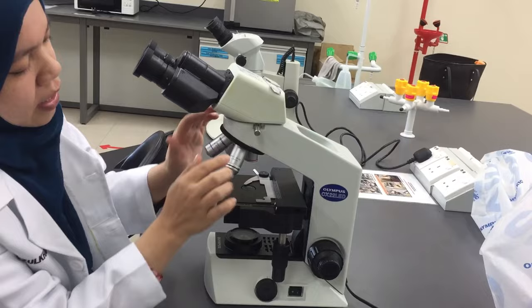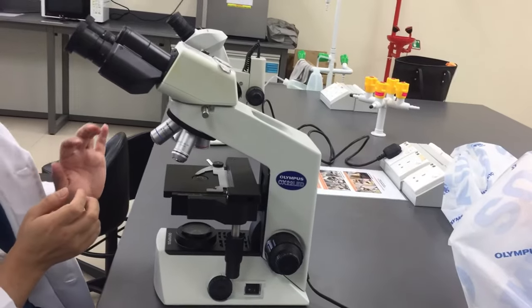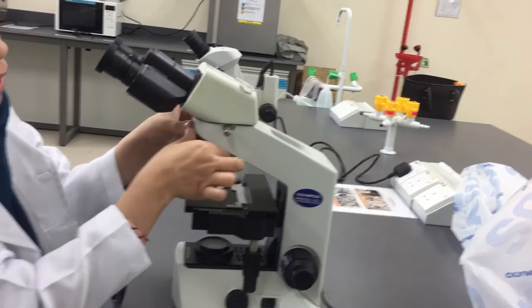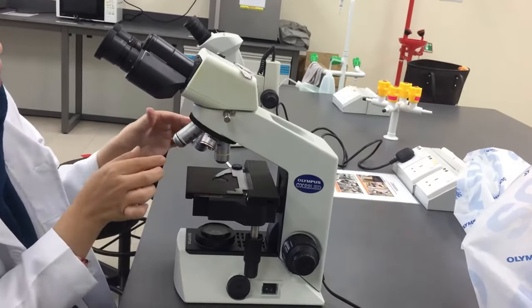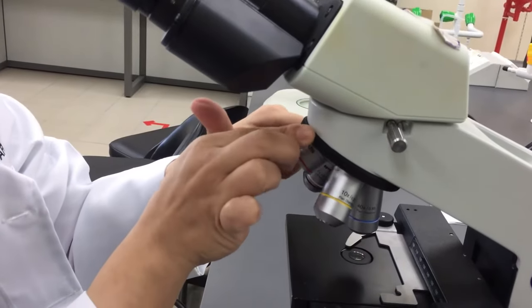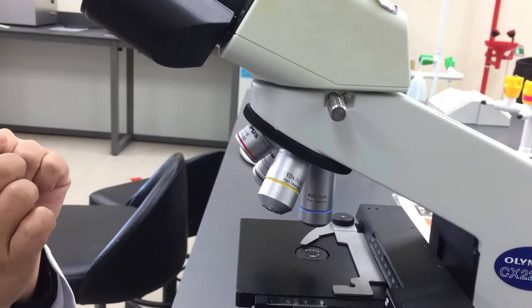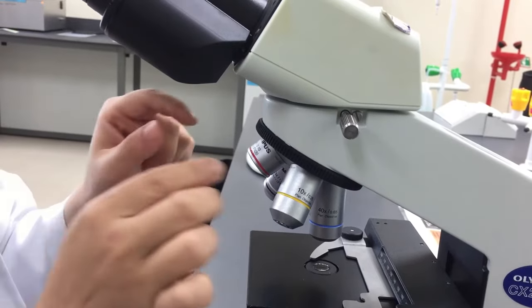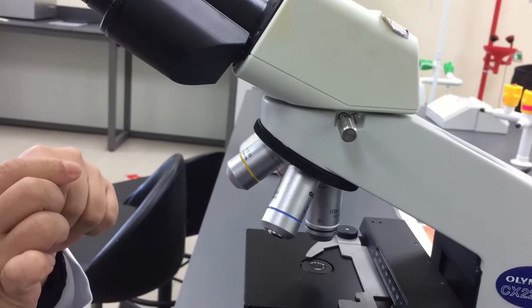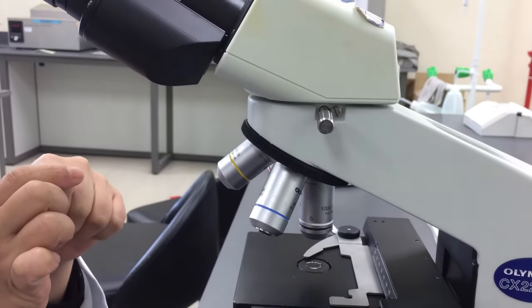Here is the objective lens. For the Light Compound Microscope, they will have four types of lens. Beginning with 4 times magnification, the red color. And then it goes up to 10 times magnification with the yellow color objective lens. Then the blue color gives 40 times magnification, which is the high power objective lens. And the black color will give 100 times magnification using the oil immersion, so it is known as the oil immersion lens.